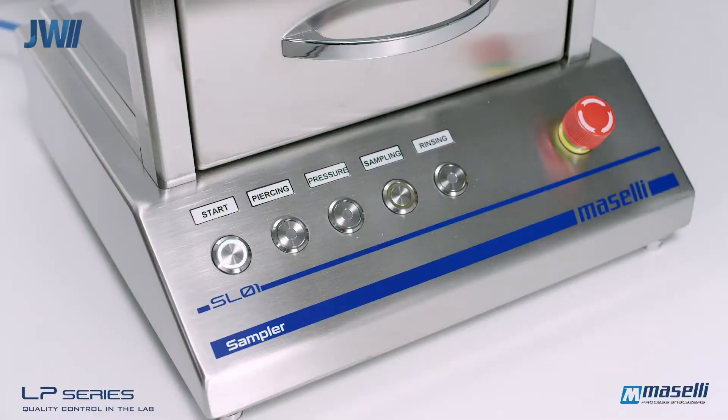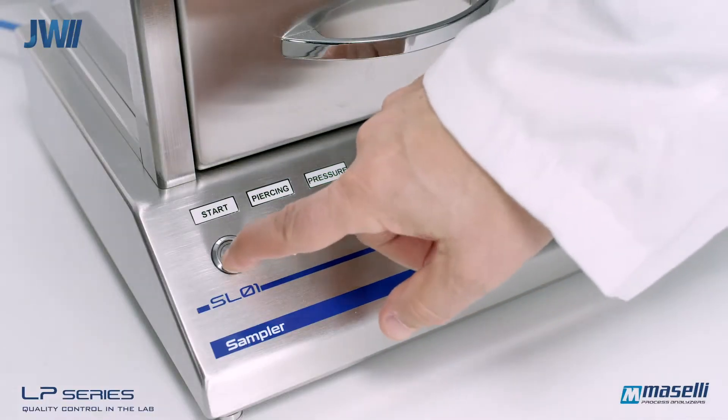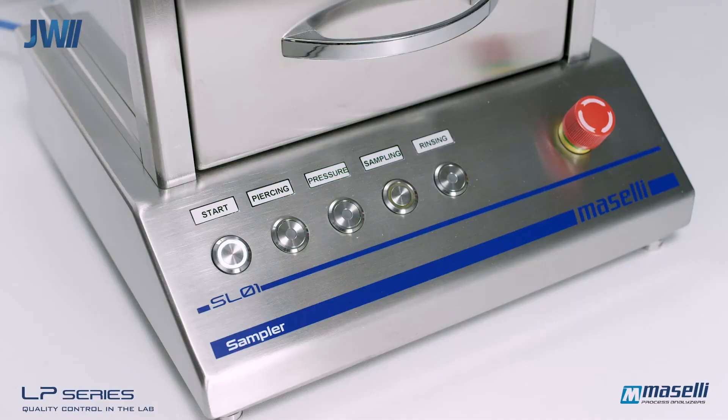A safety interlock will only allow sampling to begin once the door is fully closed. The start button is pressed to initiate sampling, and this can also be configured to start automatically once the door is closed.